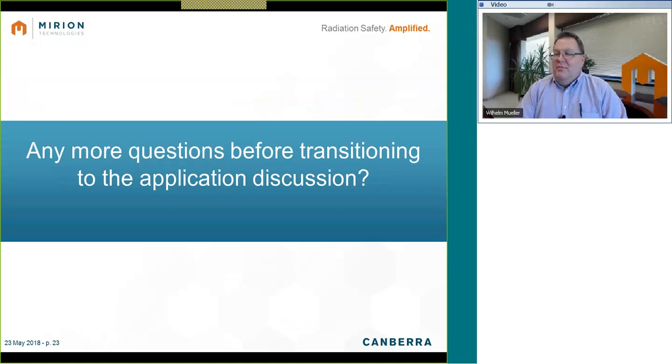I have a question: is the ceramic well insert available for existing Sagewell detectors? Yes, this well would be retrofittable on existing detectors. It will have to come back to the factory to have that exchange, but it can be done for essentially the cost of the end cap and a vacuum service to restore the detector.